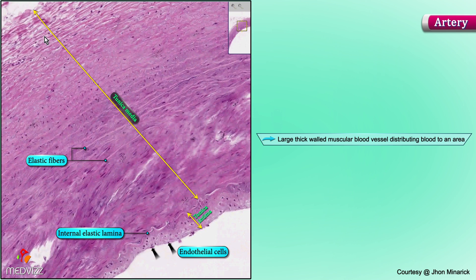So this is just a large or medium-sized artery — it happens to be a superior mesenteric artery, one of the main branches of the aorta in the abdomen. You can see that the thick smooth muscle cells and elastic fibers compose the media, and the elastic fibers are more common towards the lumen. Then you have this large, wavy, squiggly elastic fiber called the internal elastic lamina.